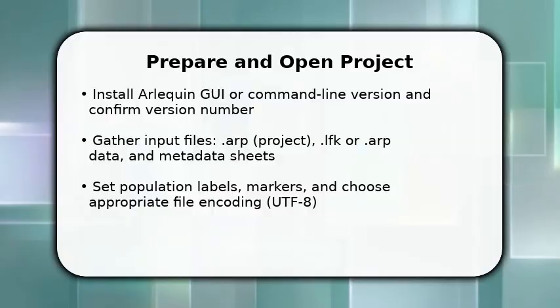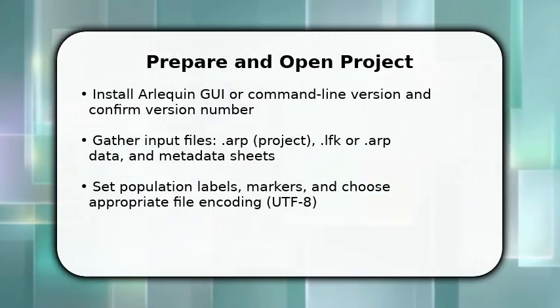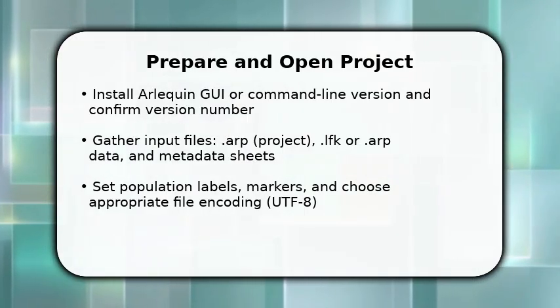Please enjoy the video. You begin by verifying prerequisites and then open Arlequin with your project file. This gets you into the working environment immediately.